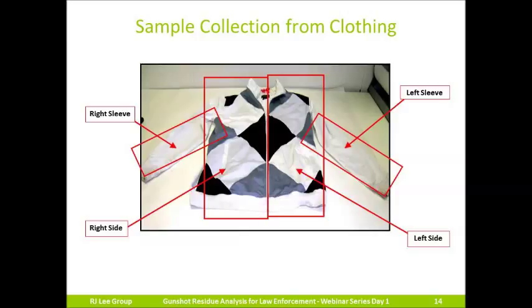Particle extractions of clothing and other items, let's say purses, phones, sunglasses, can be sampled at your agency given that you have an appropriate area and clean room to use. Or if you don't feel that you have a clean, contamination-free area, they can always be sent to the lab, like RJ Lee Group, and we can sample there, followed by the analysis.